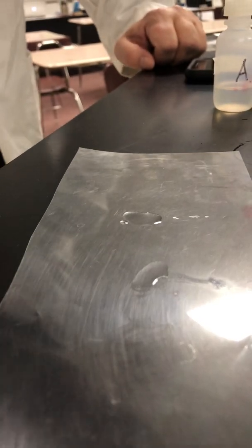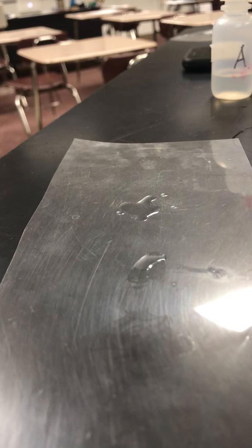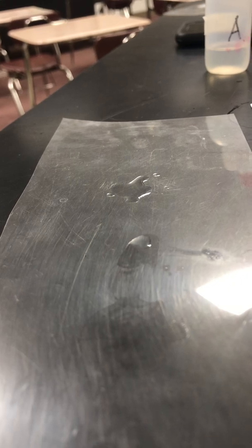Yeah, the acetone's still there. Definitely still have acetone, no hexane, no unknown. Our warm ethanol is still there. Acetone is shrinking quickly. Watching it. It's about gone. I would say the acetone is gone. Call it out. Yep.